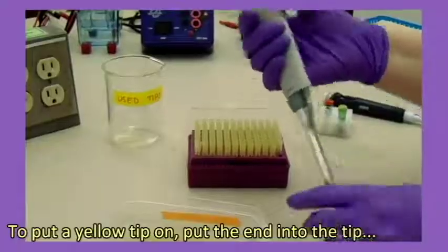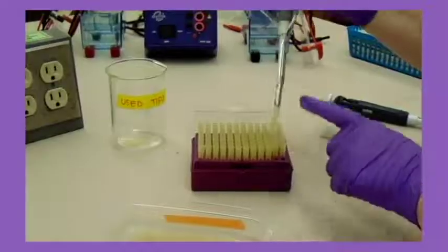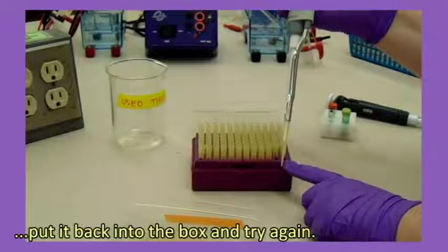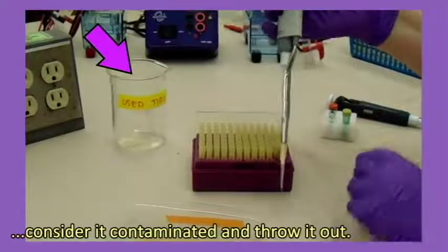To put a yellow tip on, put the end into the tip, press down and give it a little twist. If the tip falls off onto the table, you can put it back into the box and try again. If it falls onto the floor, consider it contaminated and throw it out.